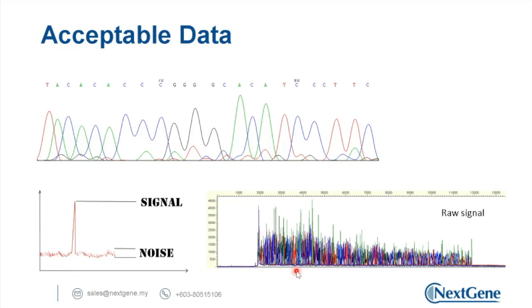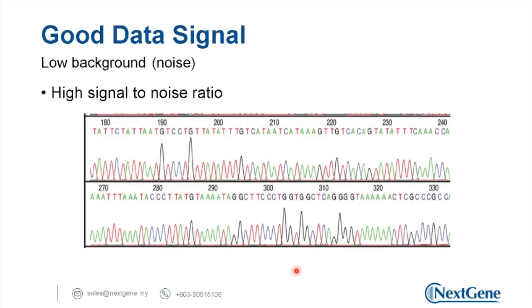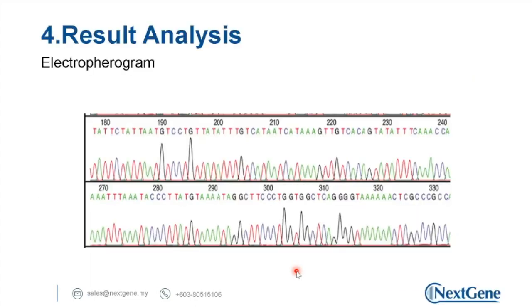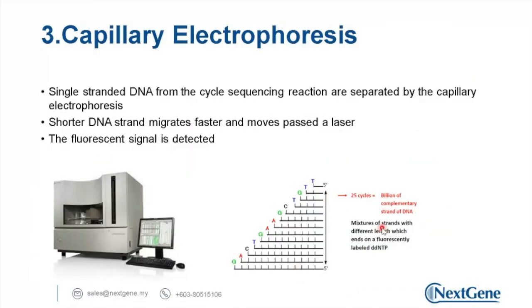And a lot of the time our understanding is that the template will be the issue because there is no template, and that's why we are unable to generate any of this kind of short fragment at all.